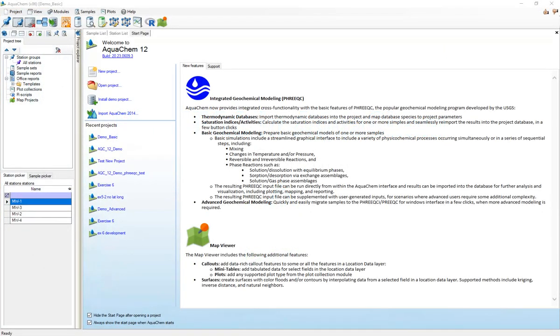Hello, everyone. My name is Nick Lyle. I'm the lead trainer at Waterloo Hydrogeologic and in this quick start tutorial I'll show you how to set up PHREEQC for use with your AquaChem projects.